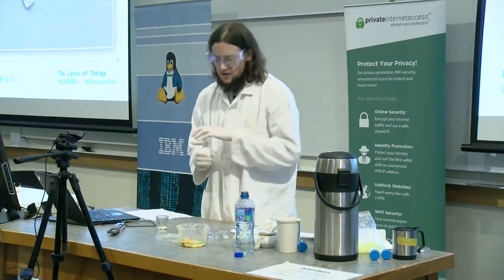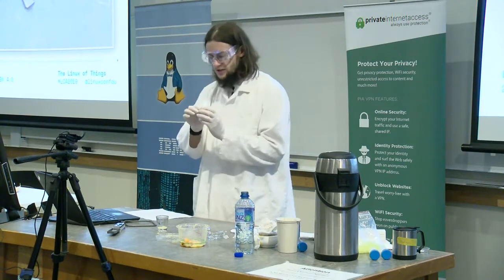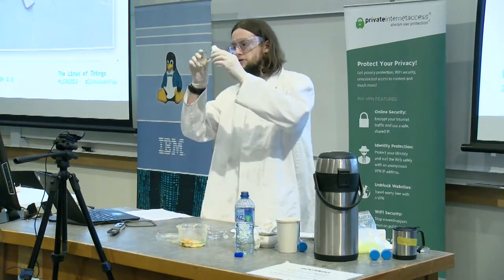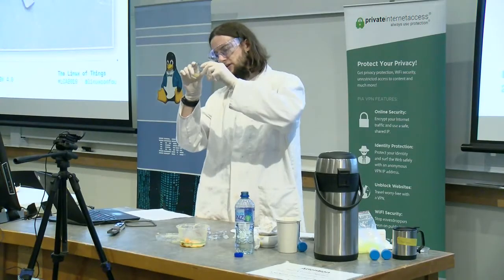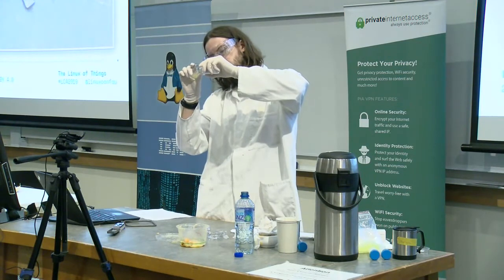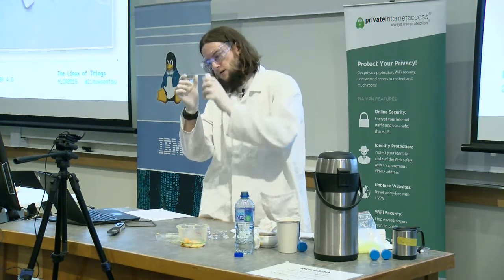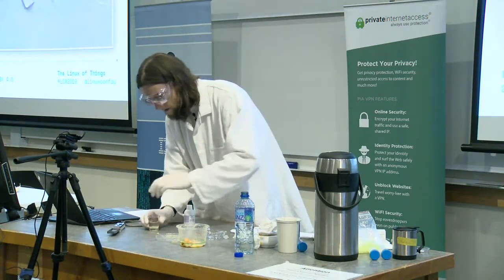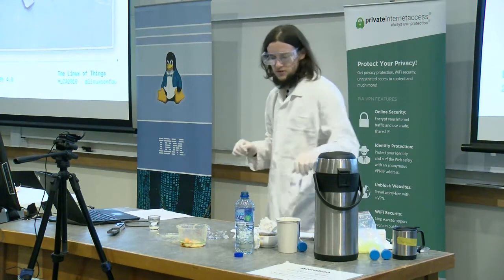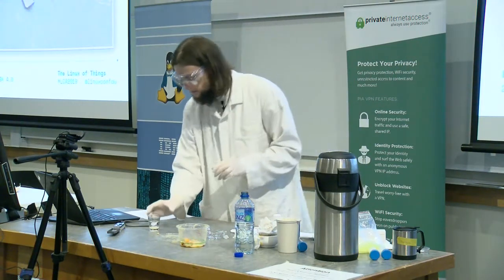Okay, so now the idea is to slide the alcohol over the top. I want to make, oh, I've got very shaky hands. I want to make a layer over the top without sort of disturbing the liquid underneath too much.